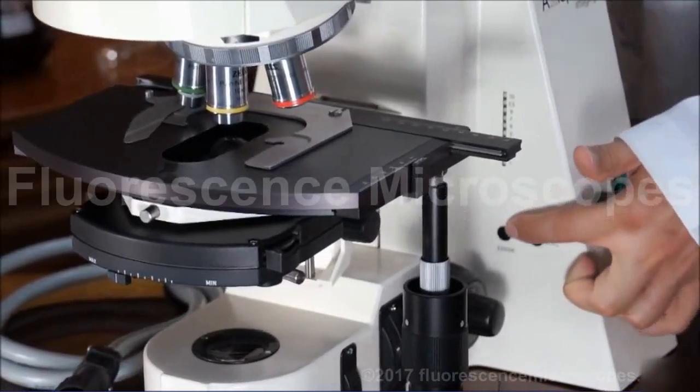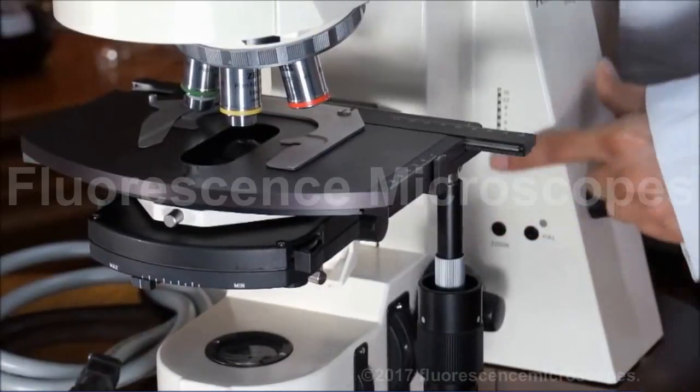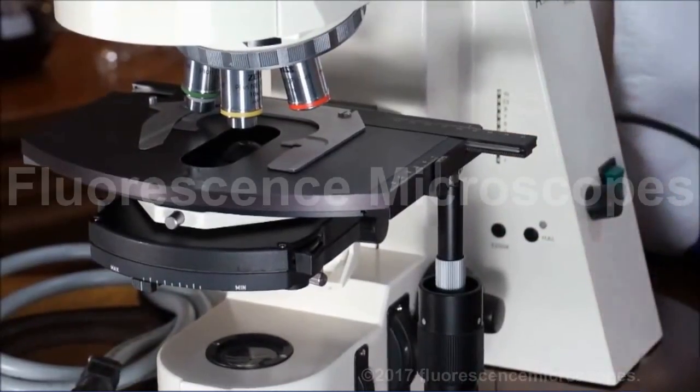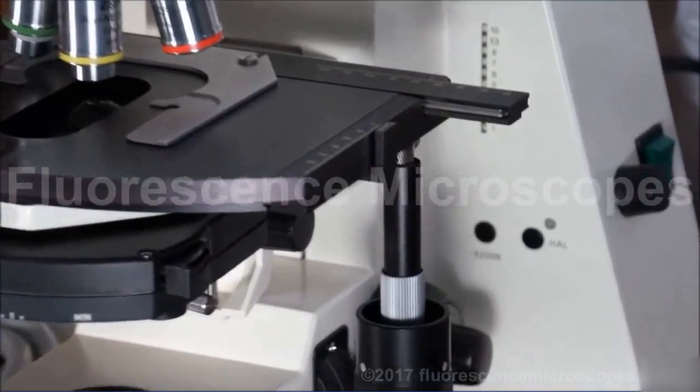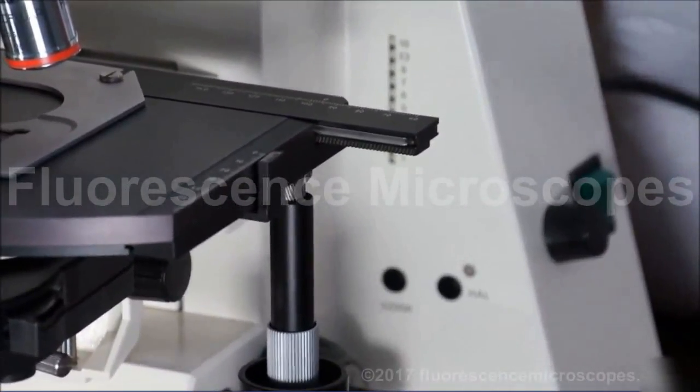You've also got a 3200K button. You press this and it gives a certain voltage and that's going to give you a daylight color.